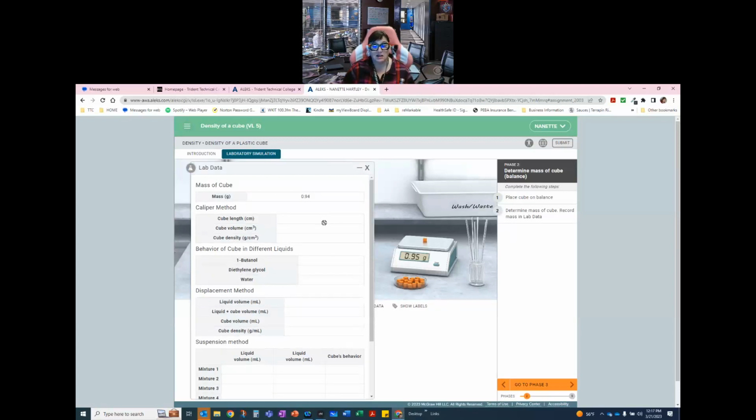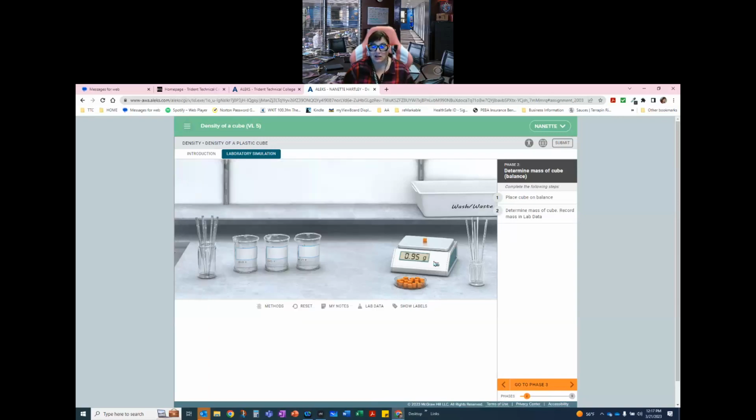And this is what I was talking about, not having tared the balance or not done it appropriately. Oops, I forgot about that. So again, making sure that you've done exactly what it's asking for is a really big deal. It's also kind of picky about where you click things. So it may be that you're trying to click something and it's not taking it.